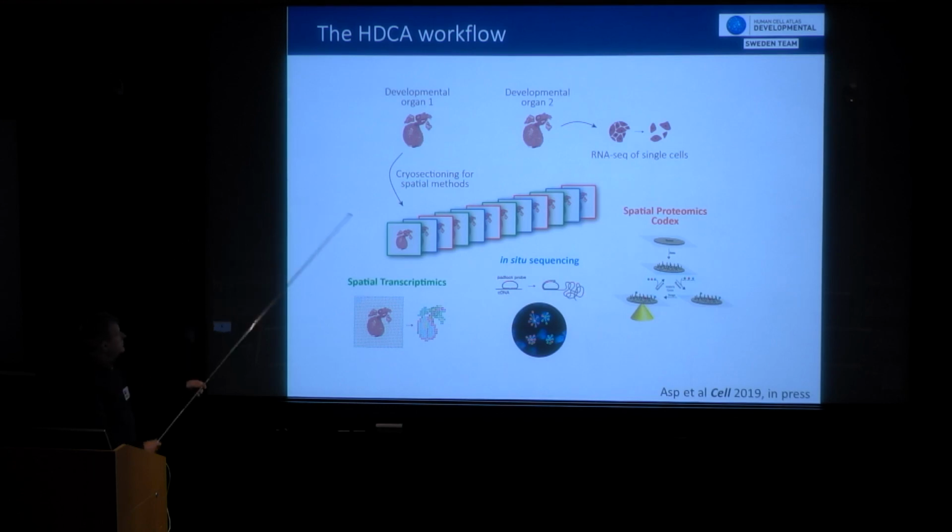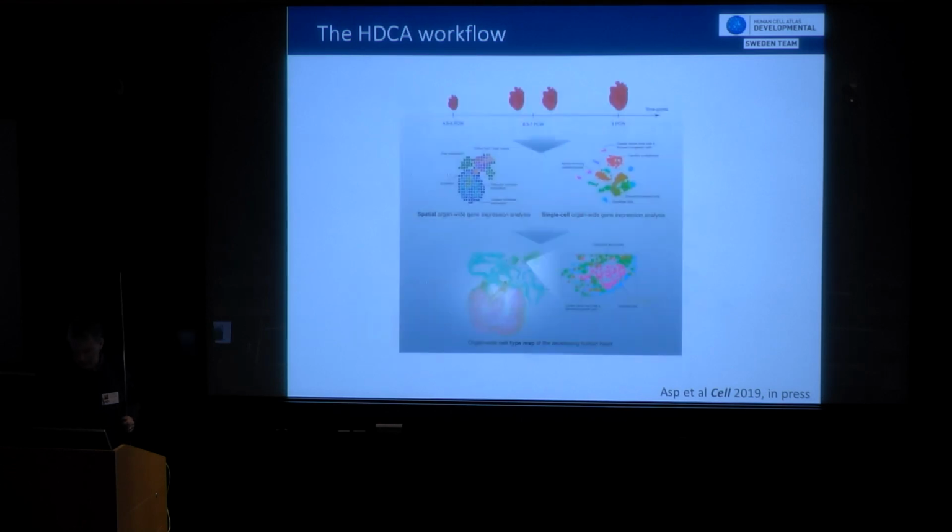So practically what we do is that we are sectioning our samples, which are extremely precious, obviously, for the different technologies, ST, combining that with in situ sequencing and doing proteomics on this. And combining that with some data-driven analysis of single cells. Together, we're creating a very rich resource, and this was recently accepted as a resource in Cell.